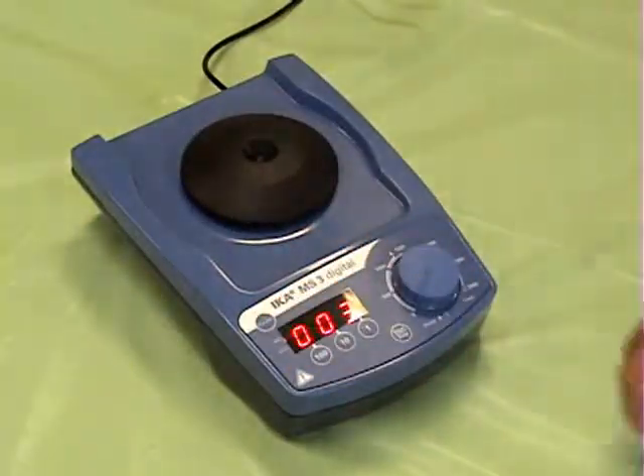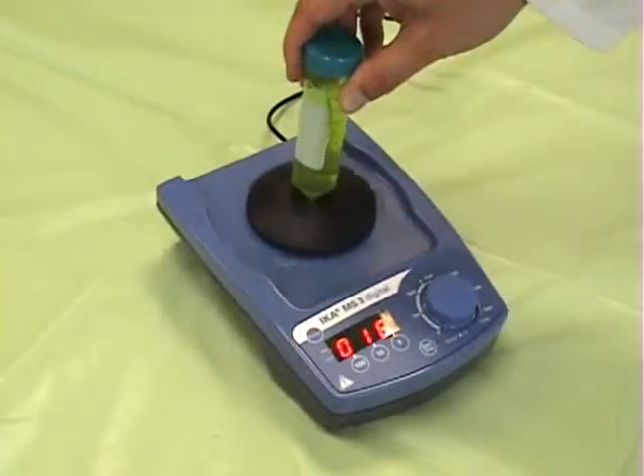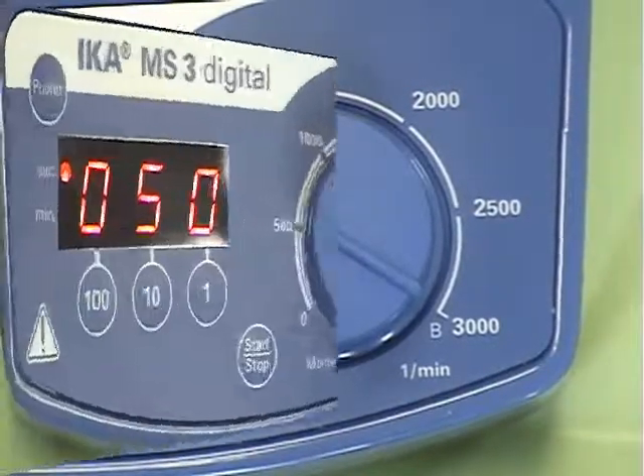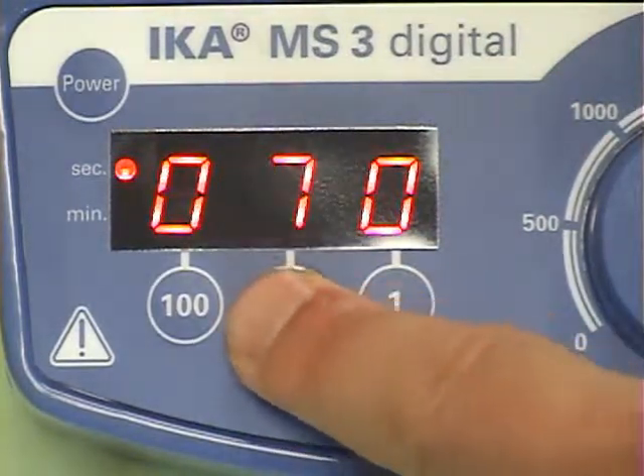The IKA Compact Shaker is an extremely versatile shaker for a wide range of small volume applications. The unit is equipped with analog speed control and digital timer for precise, repeatable results.